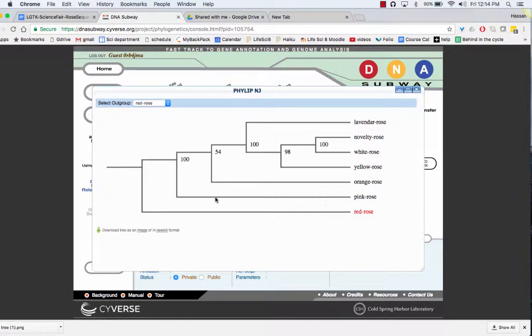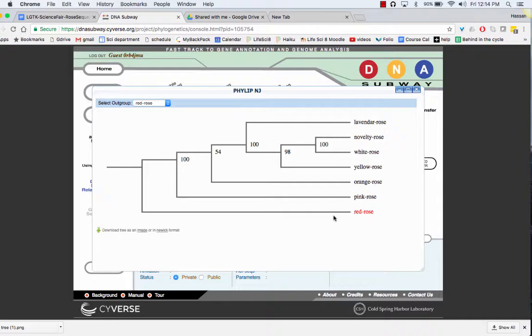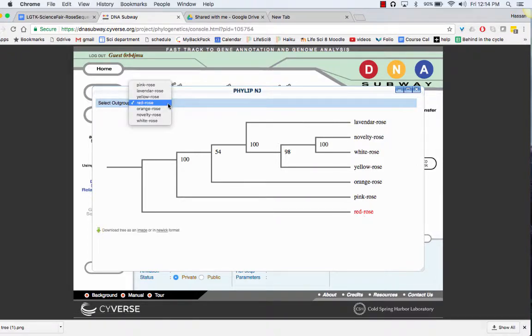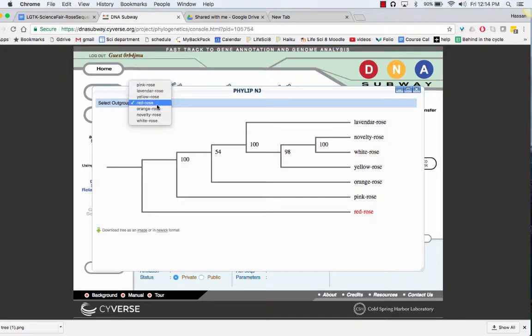If you happen to know which of the sequences is most different as a comparison, like the red rose here, you can click on a different outlier.